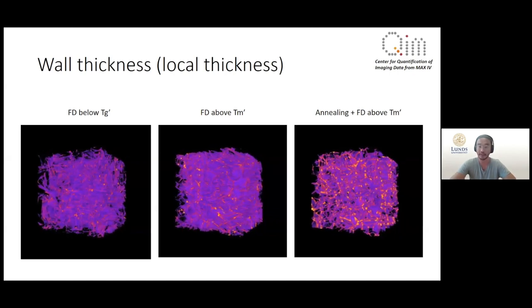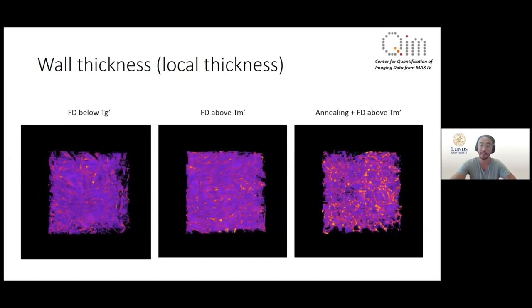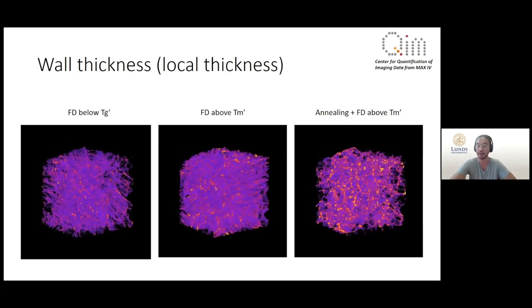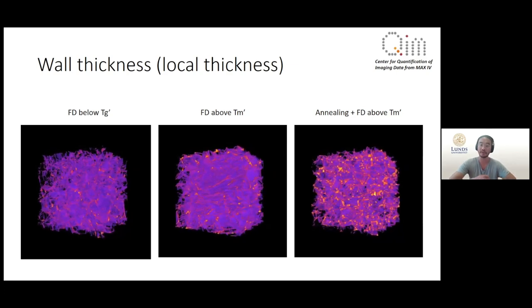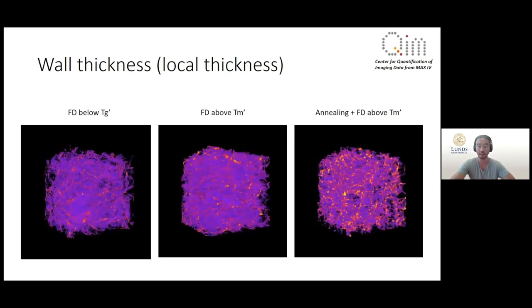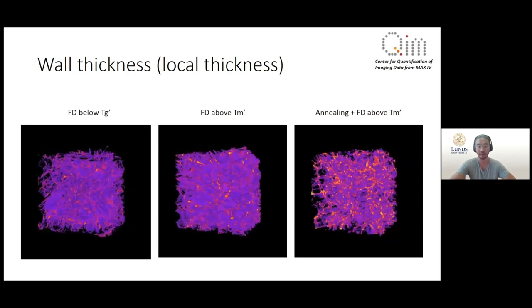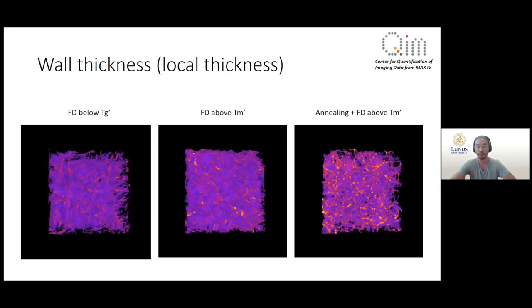Looking at the local thickness here we can see that the thin parts are colored purple and the thicker parts are colored red and yellow. As expected, the difference between the first and second sample is not that noticeable while the third samples clearly have a thicker material, confirming our hypothesis. This is very valuable information when we want to investigate how structures can influence the shelf life of probiotics.